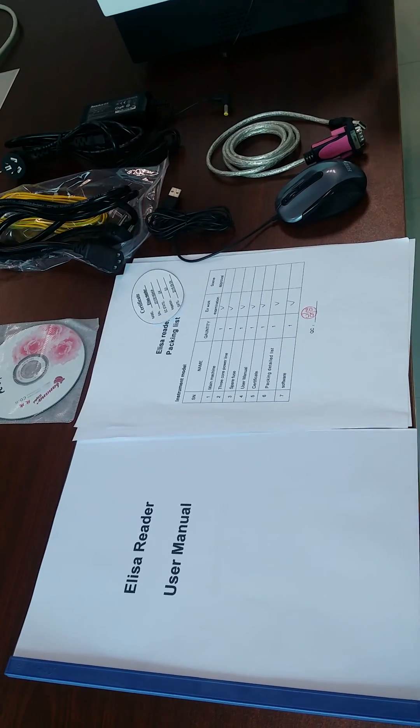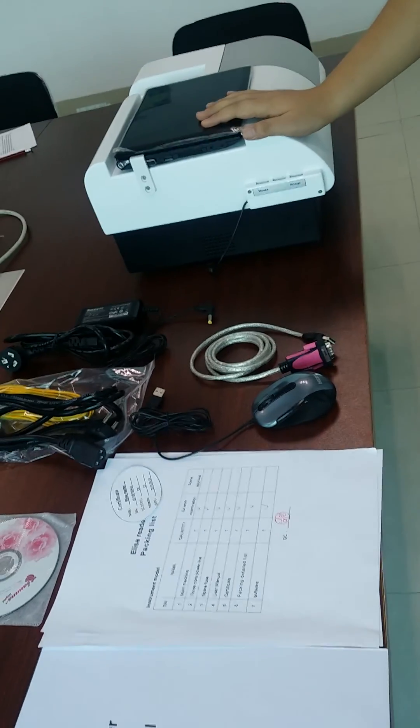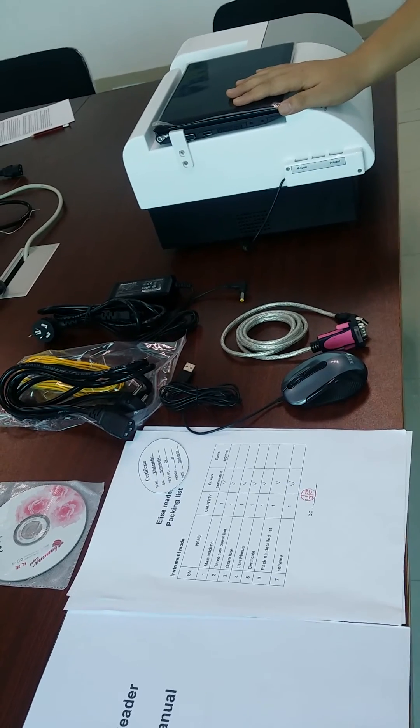Hello, thanks for buying our machines. Today we will show you how to install our machine after you get it.